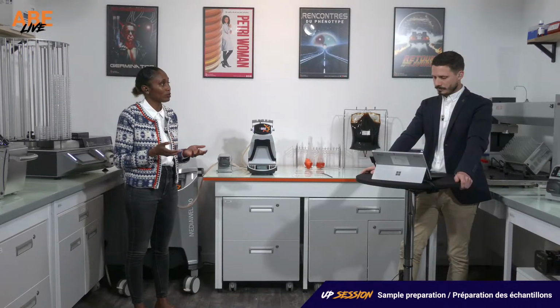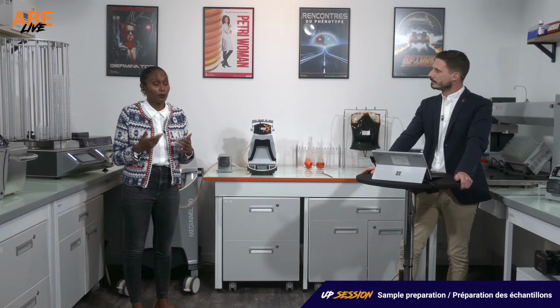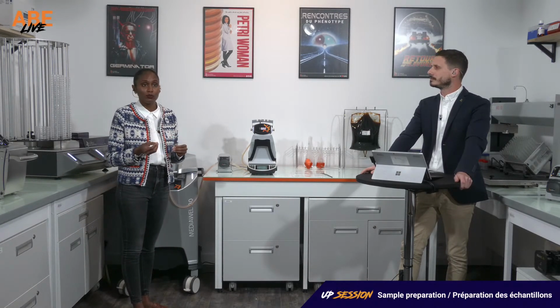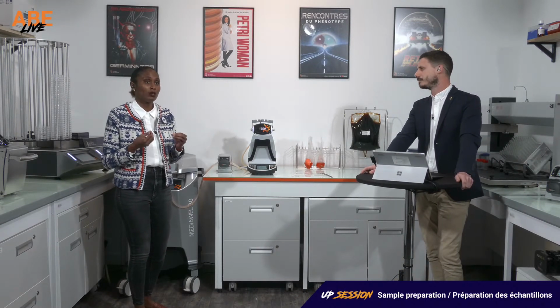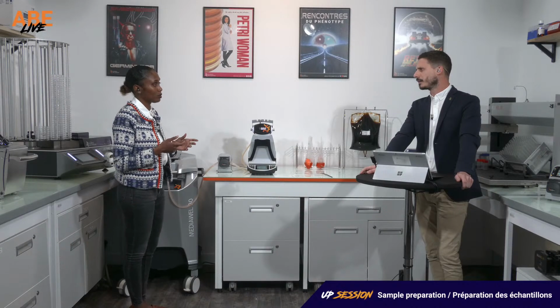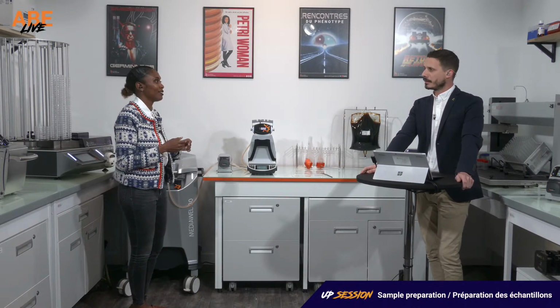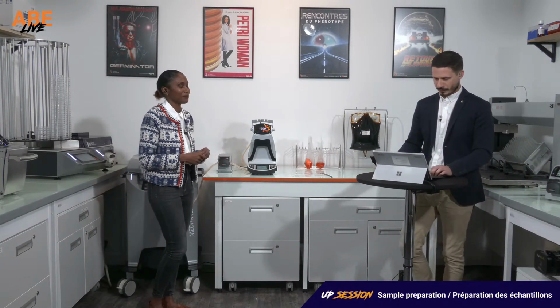The second option is to consult all this information on the lab page. The lab page is actually a portal linked to your equipment, and all the information since the installation of your equipment will be stored on the lab page. Sylvain, I wanted to show you this lab page, so I opened a tab on your computer. Maybe you can share your screen, please? Yes, sure.